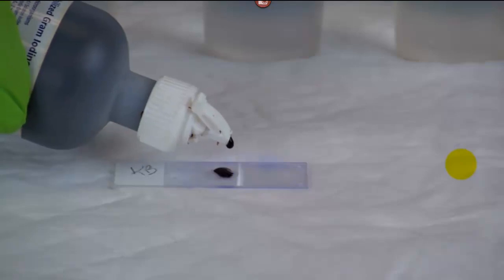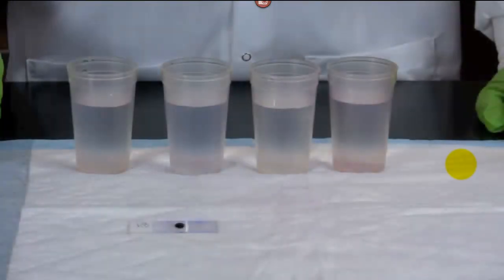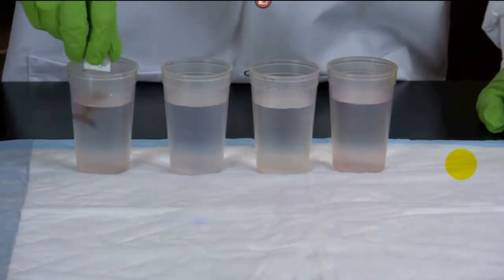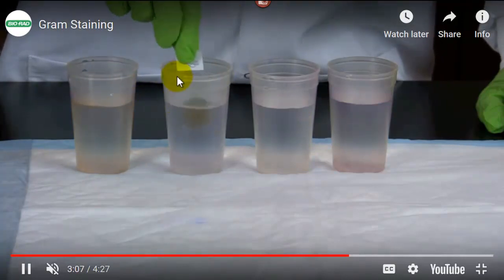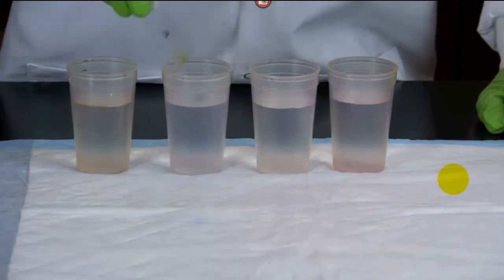Okay, Gram's iodine. You're going to add this for a minute. Iodine is called a mordant. It's supposed to intensify the stain inside the cell. It actually binds with the crystal violet and gets where you can't wash it out. So he's going to put this part in water as well, it looks like. We rinse, but that's fine. And you can see on the slide up there that little smudge in the middle. That's the cells that have adhered to the slide. Now they're stained, and they're purple because crystal violet was the start.